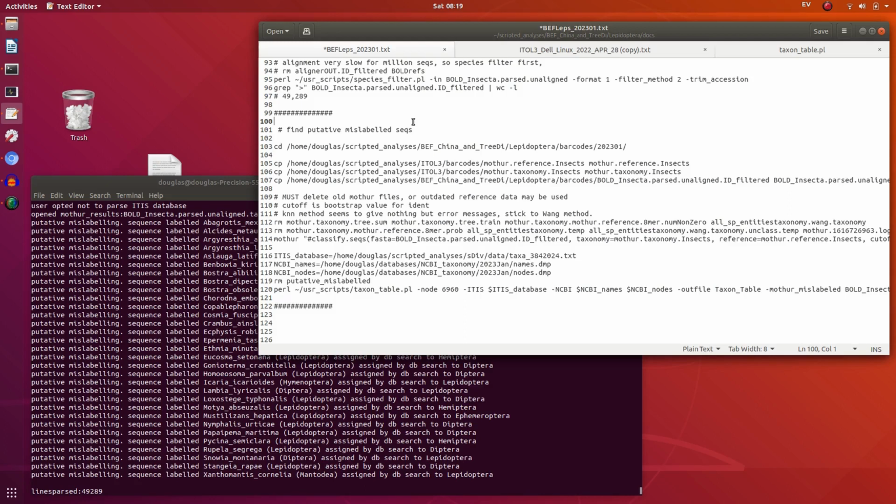It will pull in those sequences which are similar in sequence, which are unconstrained, and as they will have a different taxonomy, you get this effect. And similarly, if the mislabeled sequences are not constrained, they will go according to their sequence similarity to their relatives, and you'll get a similar taxonomic mess.